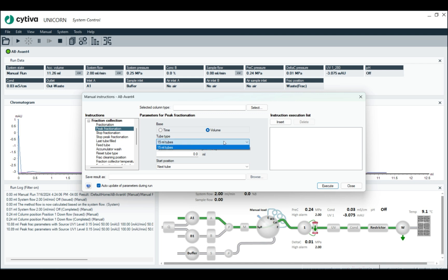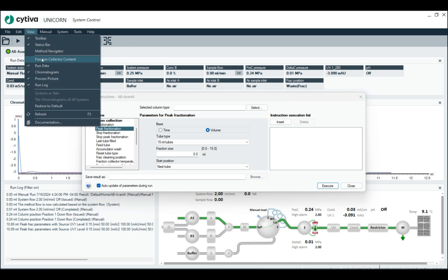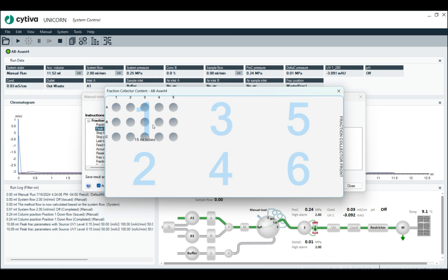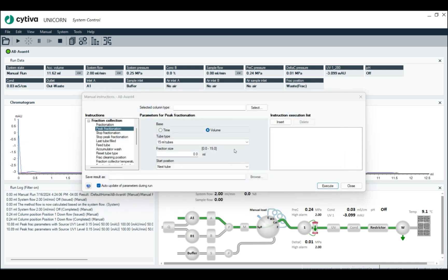So right here, and then we're going to collect in 15 mil tubes. We can do our tube sizes. Let's look at the fraction collector really fast. Fraction collector content. And you notice I only have one rack of 15 mil tubes. So that's the only thing that'll allow me to collect. That's the only thing it's going to populate here.